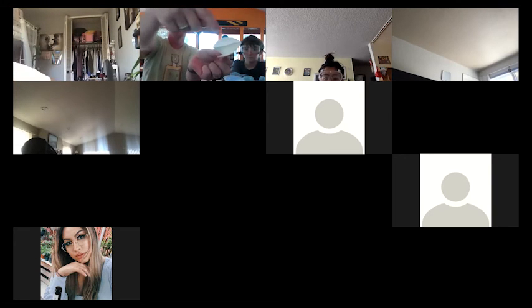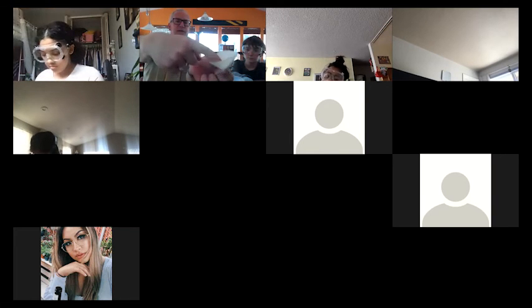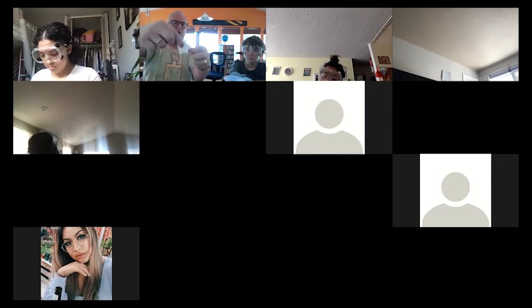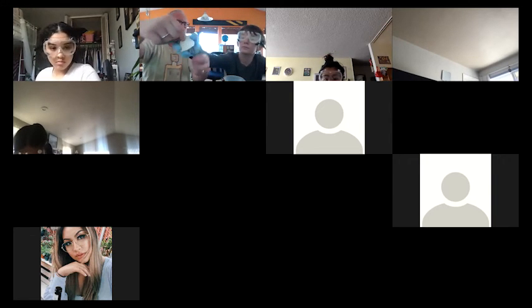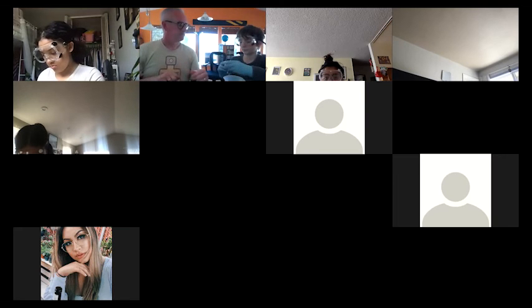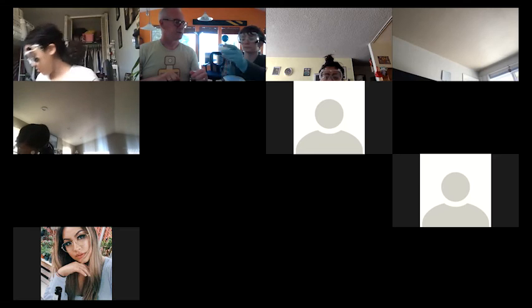Yeah. So just put your finger in the first one. So here I got the first layer, and just pull it out and do a cone. Oh, okay. So now I've got a cone. Yeah. Okay, got it. Excellent, Raj. Okay, thank you. Yeah, and then it should fit perfectly in the filter.